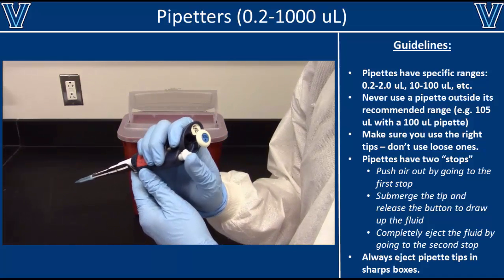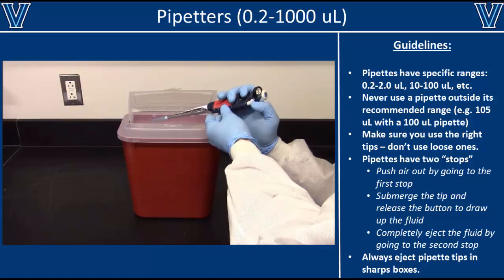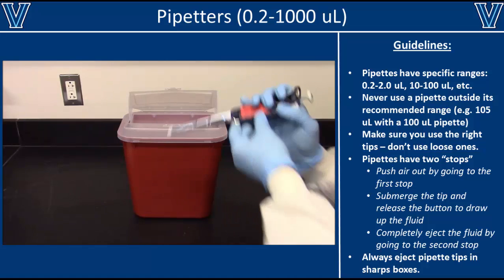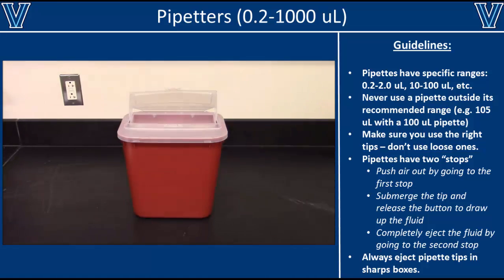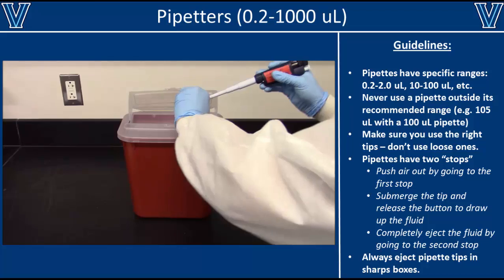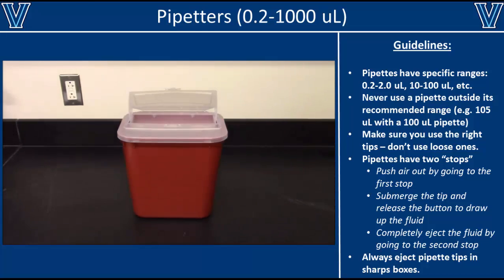When you are done using the tip, eject it into a sharps box using the ejector button, as shown here. If your pipette does not have a working ejector button, you can always take off the tip manually by hand.